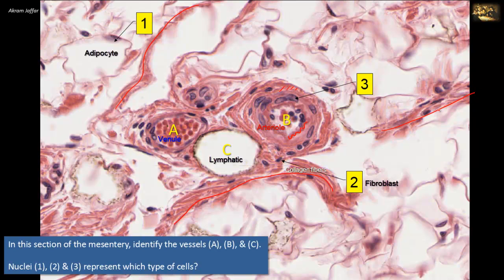The nucleus 2 belongs to a fibroblast of the connective tissue partitions made of collagen fibers. This collagen is produced by the fibroblasts. Fibroblasts are spindle-shaped cells, and although the cell boundaries are not shown here, the shape of the cell is reflected on its nucleus. Nucleus 3 belongs to a smooth muscle cell. These cells are again spindle-shaped, but larger than the fibroblasts, and the nucleus is again spindle-shaped and central. The smooth muscle cells form concentric layers of the tunica media of the arteriole here, and they can also be seen in the nearby venule.